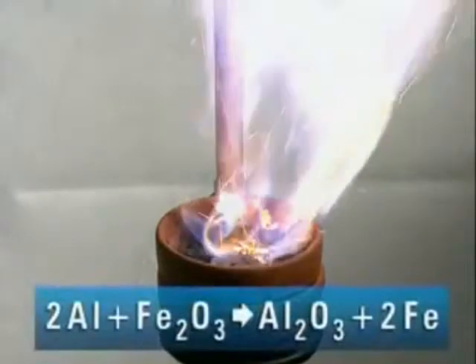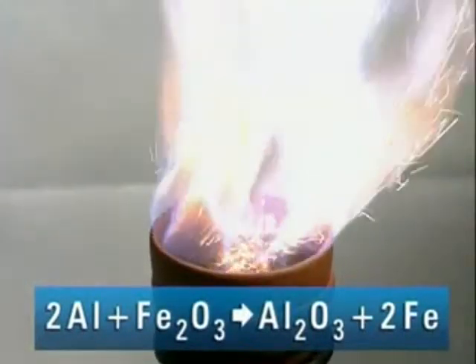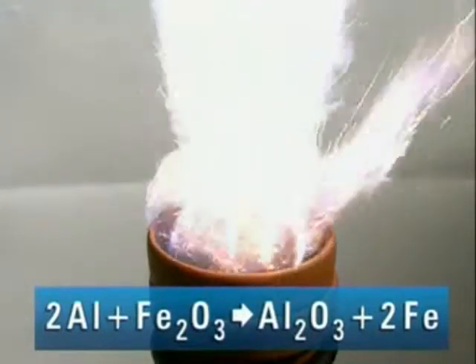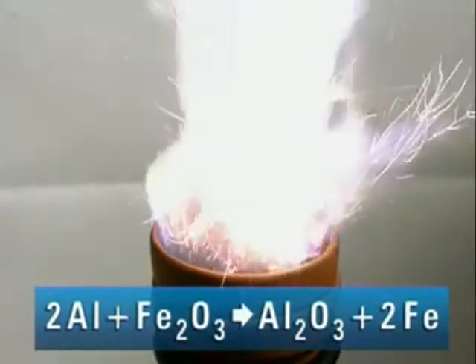Red hot molten iron falls into the bucket. The aluminium has reacted with the oxygen in the iron oxide, leaving iron metal behind. So aluminium must be more reactive than iron.